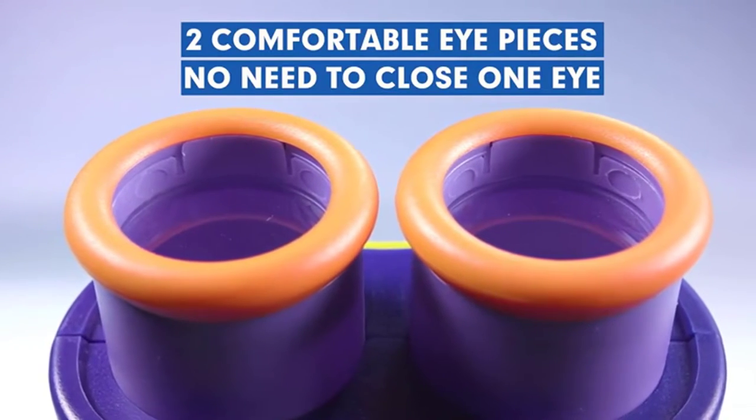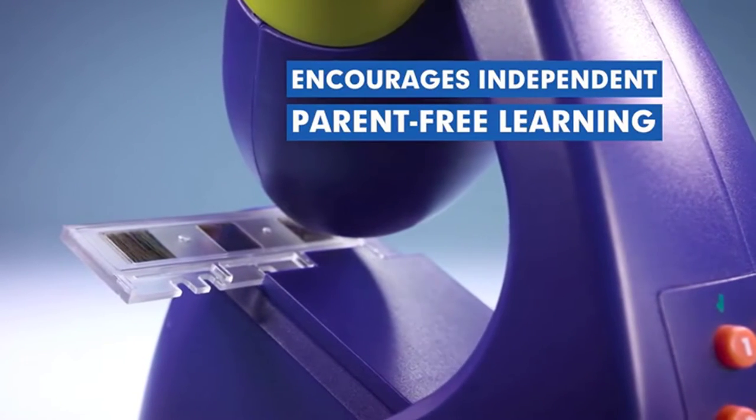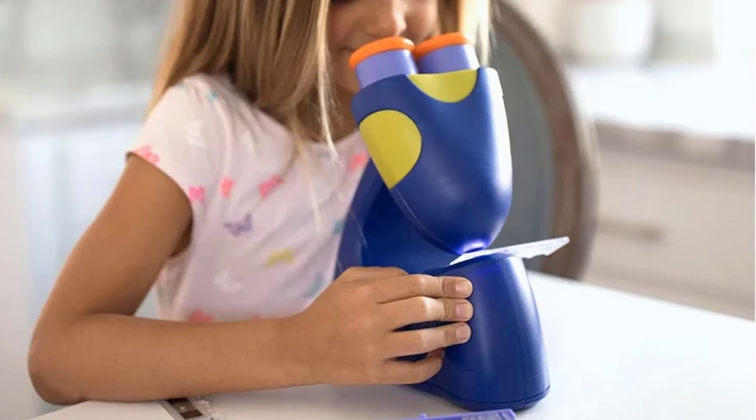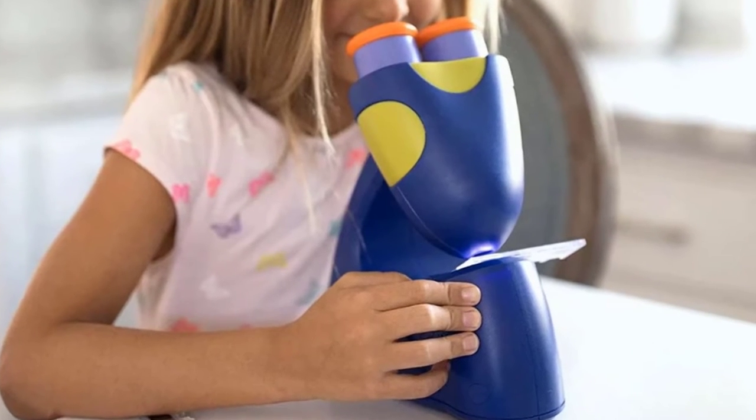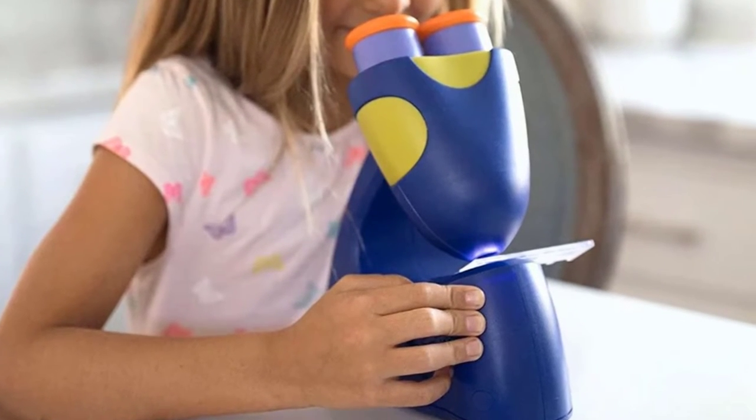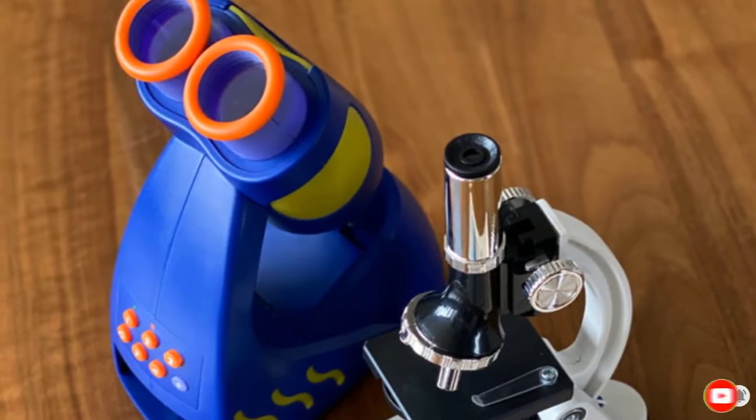Out of the box, you get 20 slides that house around 60 full-color images that kids can see up close, plus around 100 facts and questions to supplement their learning. It is available in four languages: English, Spanish, German, and French. The GeoSafari Junior is a cool science gadget to give toddler-aged children.